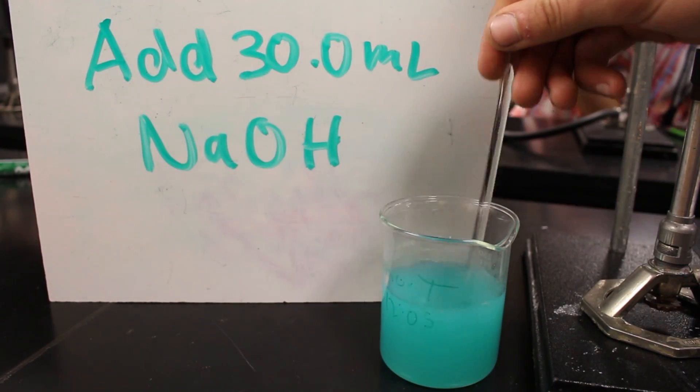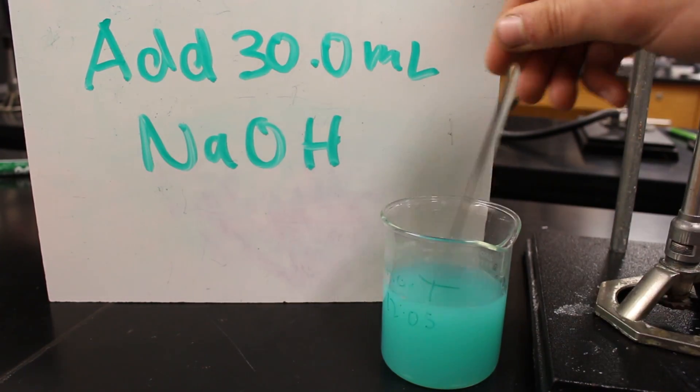With the addition of 30 milliliters sodium hydroxide, the cupric ions react to form copper 2 hydroxide.